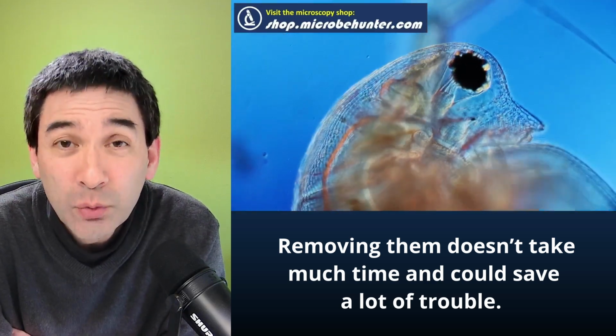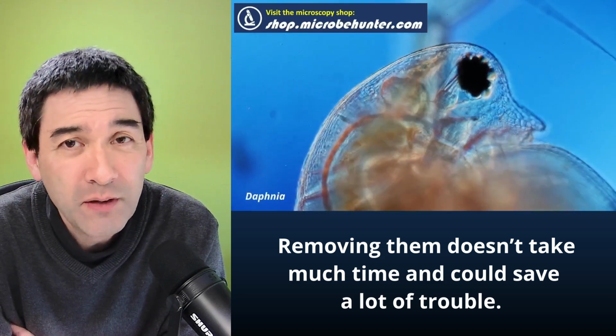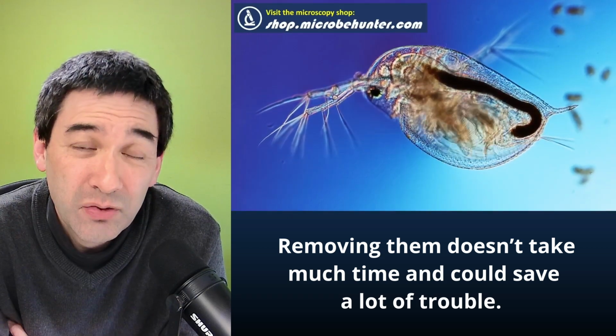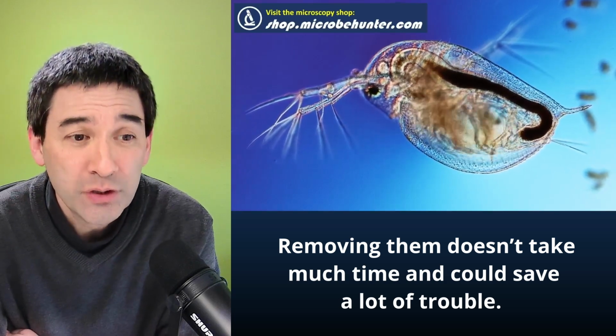So that would indeed be a possibility, but again, this is also not practical if I do not have any other objectives present, because I need those objectives again to center the next microscope slide. So this is a little bit unfortunate.